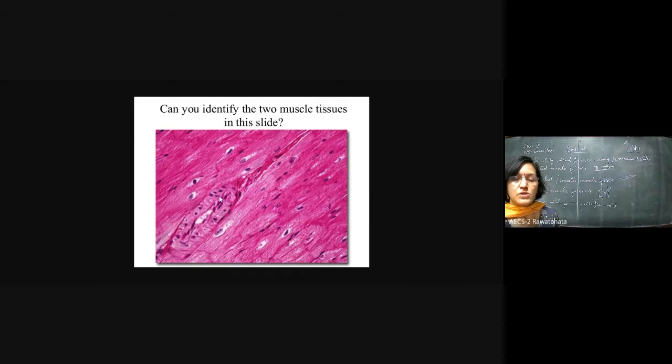And this one, you can say a magnified way, the bigger one they had shown up here. When you try to focus on these, for example, this one is so clear, tapering on both the ends, and here it has the nucleus in the center. Same happens here. But here on this side, the tapering is not that clear.